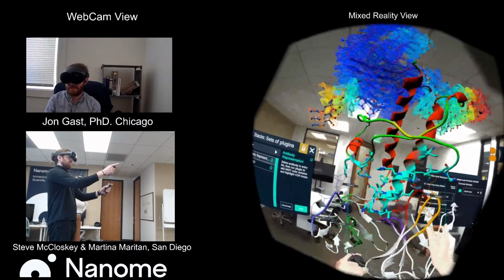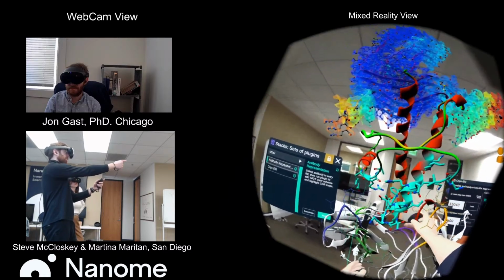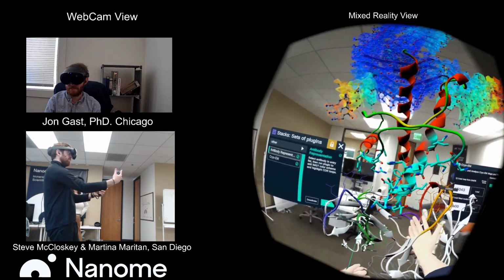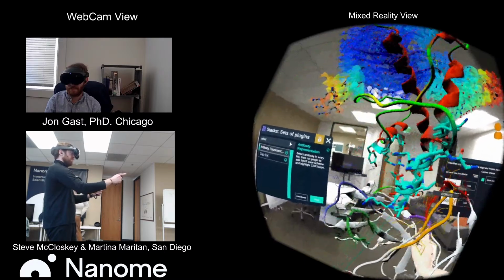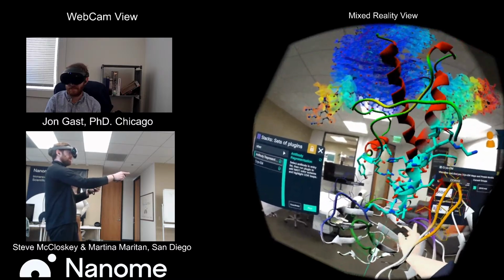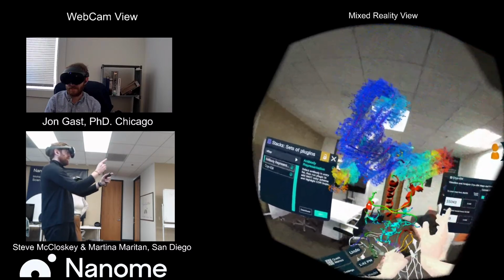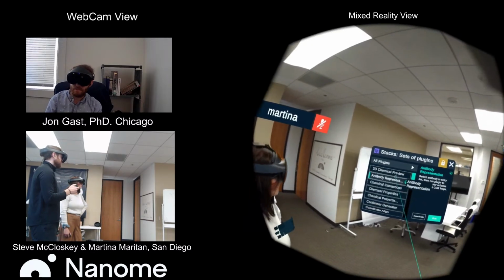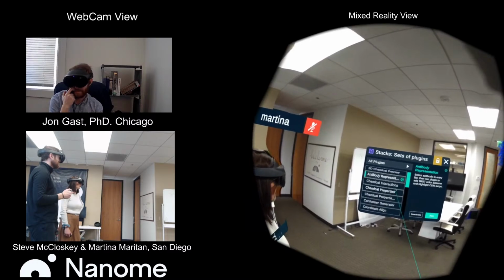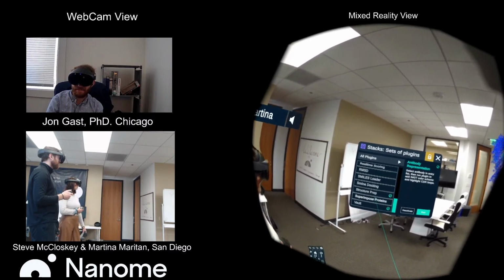This one was really great in particular for interacting with and analyzing this because, of course, there's an antibody bound structure that we're looking at. If you're trying to optimize an antibody, you're looking at the CDRs, mutating these residues on the CDRs and trying to optimize it. So I think that's one that's great. We have a lot of plugins, so it really just depends what else you want to see. The superimpose plugin could be another good one as well.